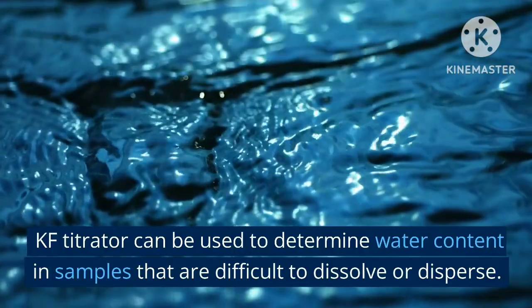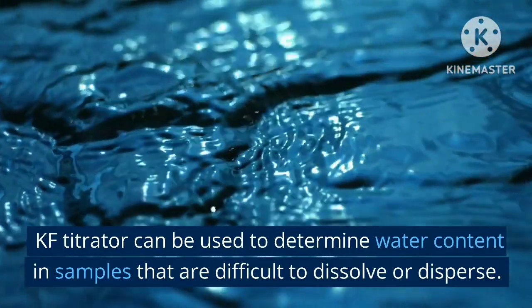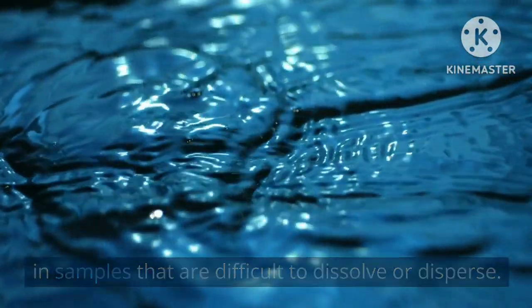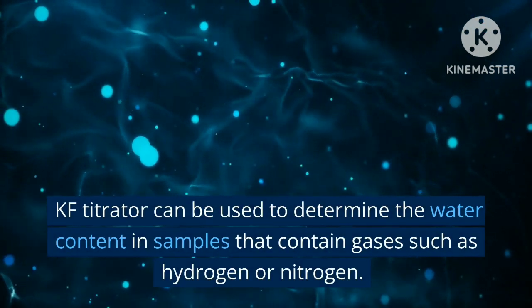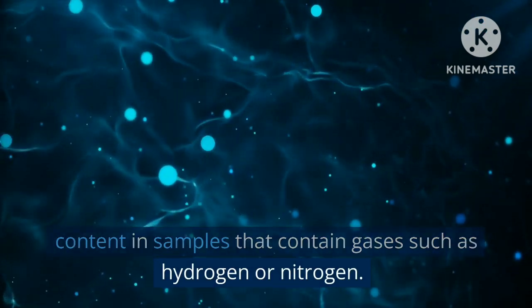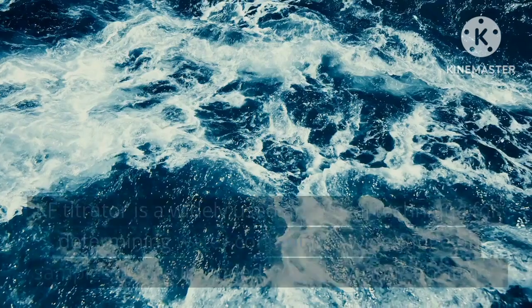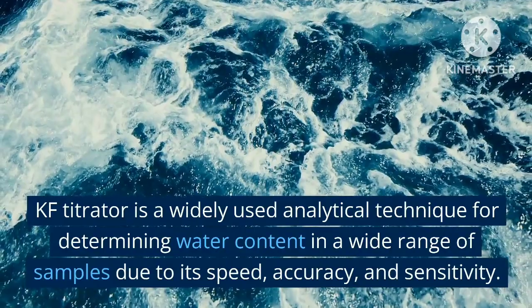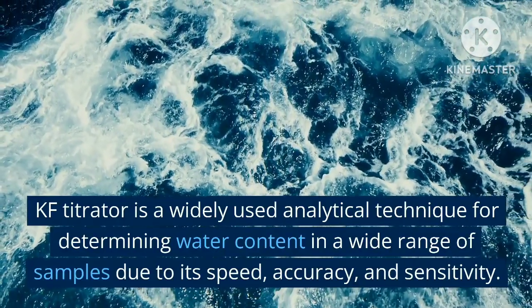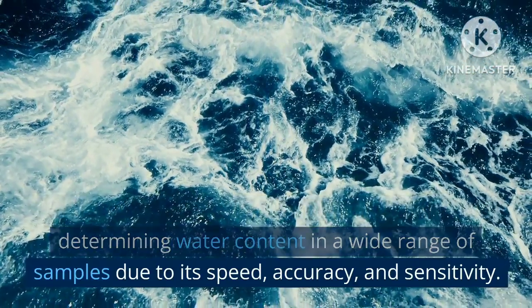KF titrator can be used to determine water content in samples that are difficult to dissolve or disperse. KF titrator can be used to determine the water content in samples that contain gases such as hydrogen or nitrogen. KF titrator is a widely used analytical technique for determining water content in a wide range of samples due to its speed, accuracy, and sensitivity.